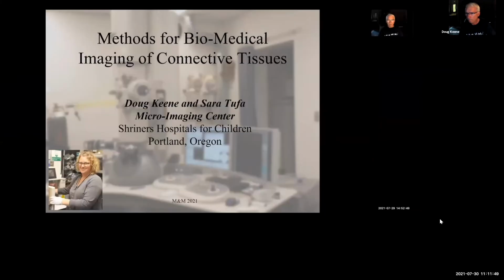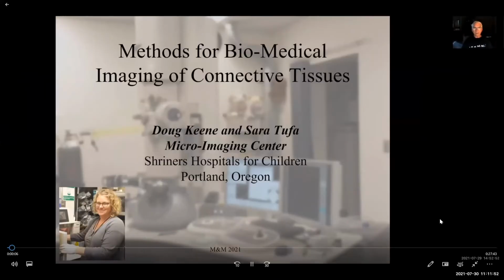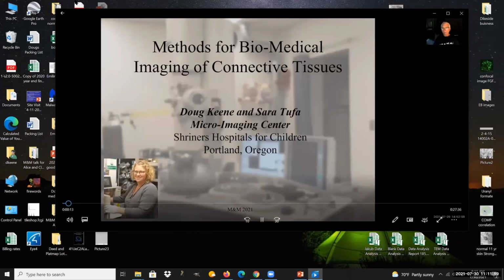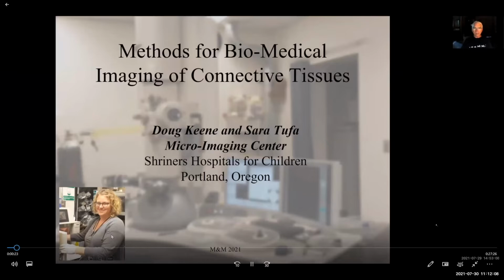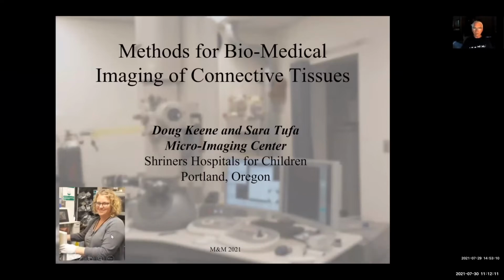Good day, everyone. Today, I'm going to be talking to you about some of the methods that we use in our laboratory for imaging pathological states in connective tissues. My name is Doug Keene, and my co-author here is Sarah Tufa. Together, we've got about 50 years of experience in connective tissue matrix research and imaging. And we'd like to talk to you then about some of the experiences we've had over that time.